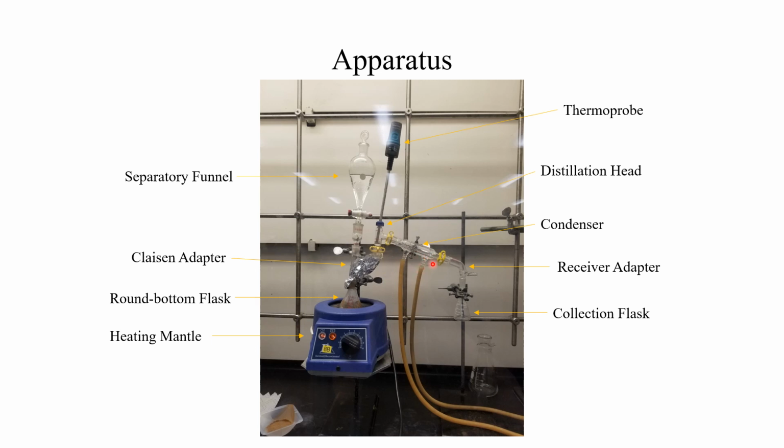And what this does is it creates a large surface area which is a lot colder, and once this very hot vapor interacts with this cold surface area, it lowers the temperature of that vapor by a large degree. And when that happens, a phase transition occurs in which the gaseous vapor goes back into a liquid, forming our distillate.